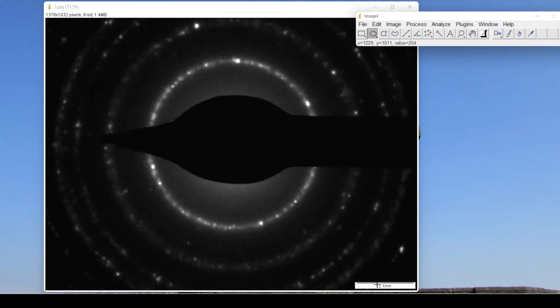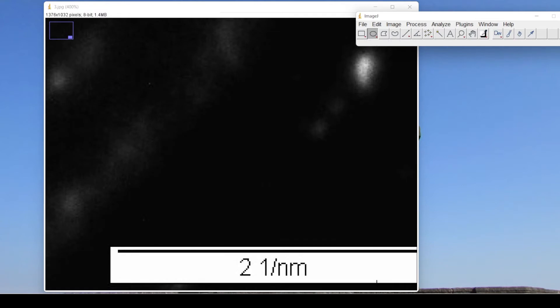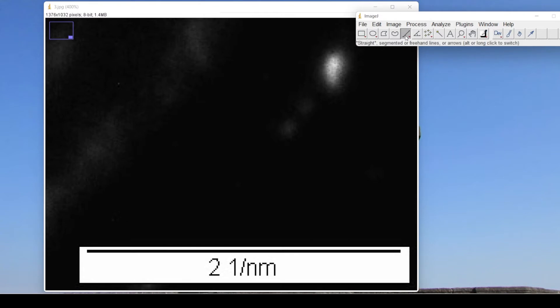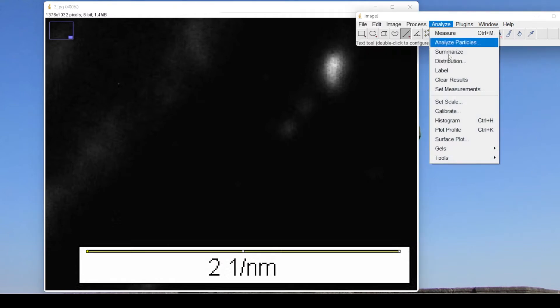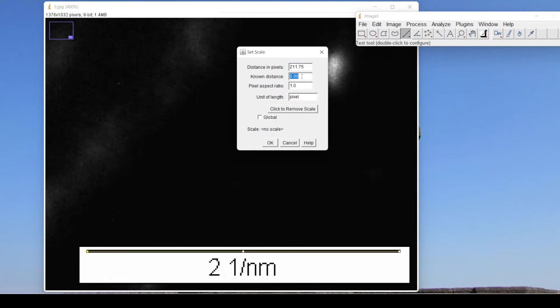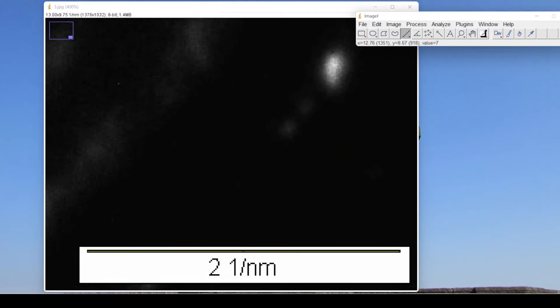Then zoom the image by pressing plus so that we can select the scale. Select this straight tool, press shift and select this complete scale. Now go to Analysis, Set Scale. We know the known distance is 2 and the unit is 1 per nanometer. Now press minus, zoom out.